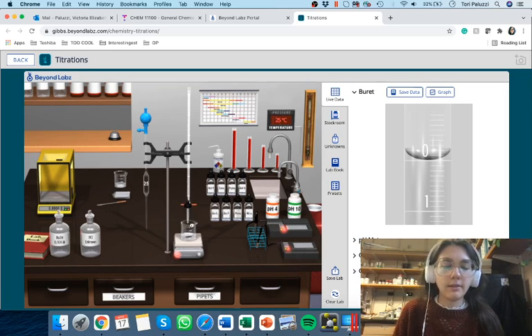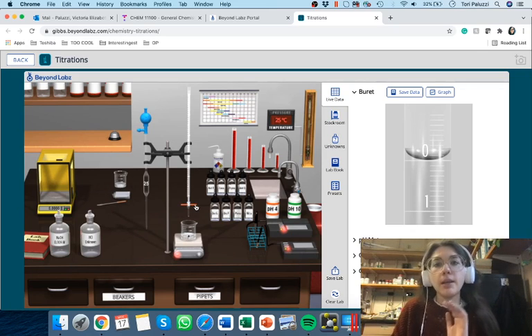There. And then essentially I have dropped in phenolphthalein. I'm going to release, and it goes back to its little thing. Then what I'm going to do is just show you a scout titration to not waste your time. If you want to do a real titration, what you're going to do is kind of what I do.